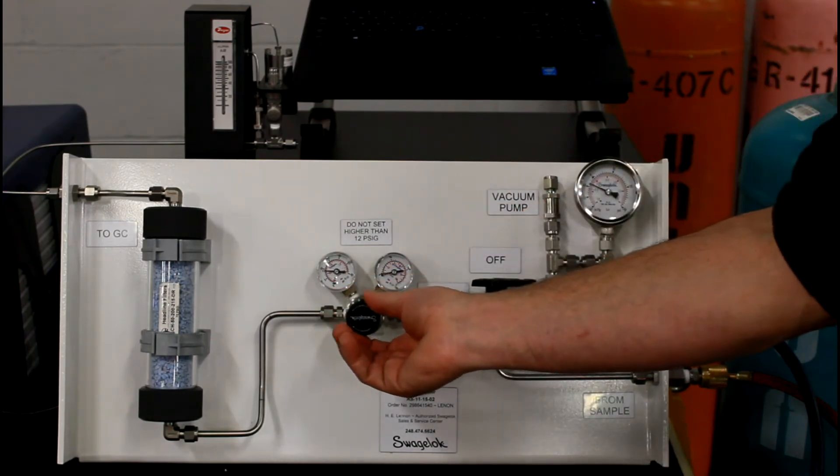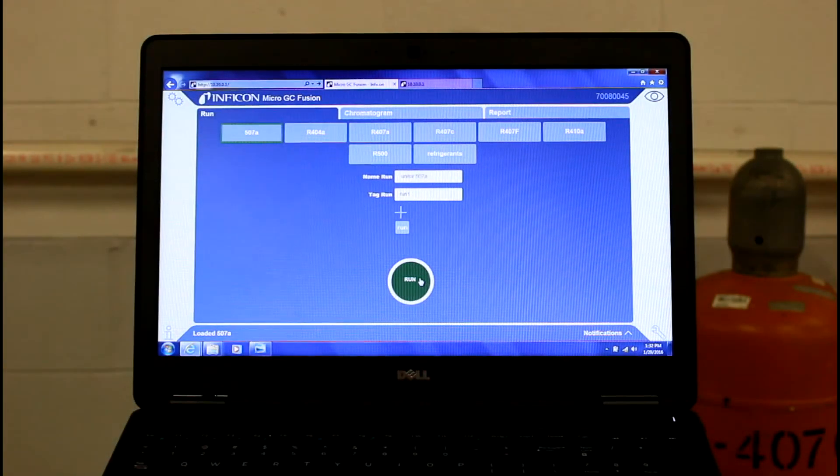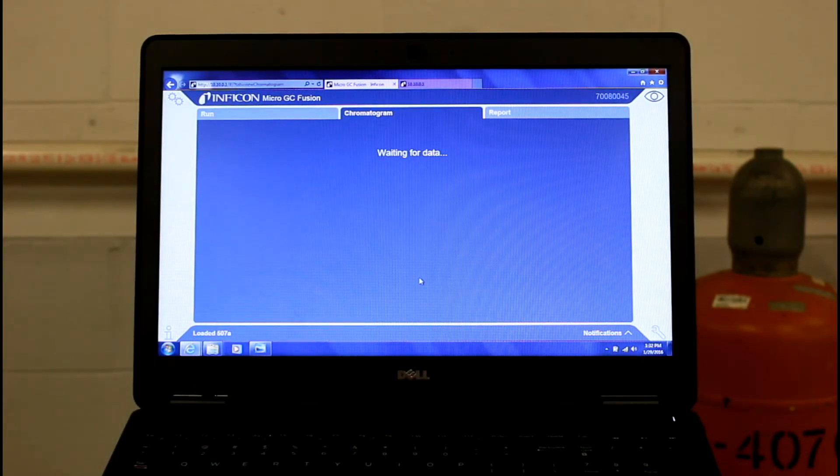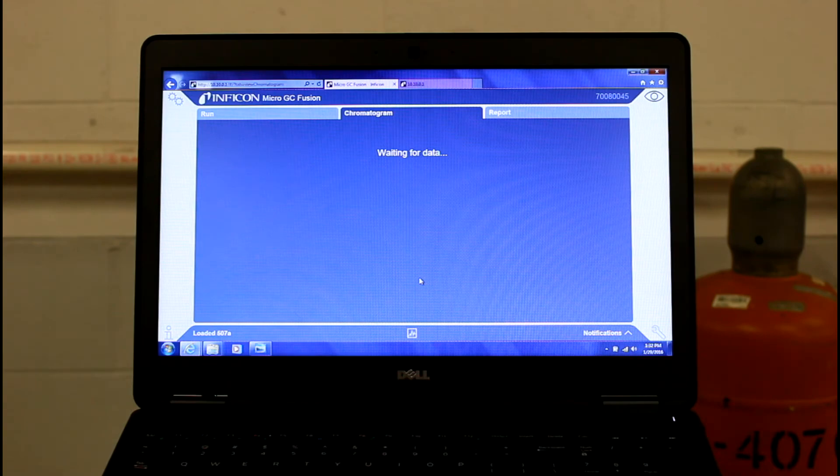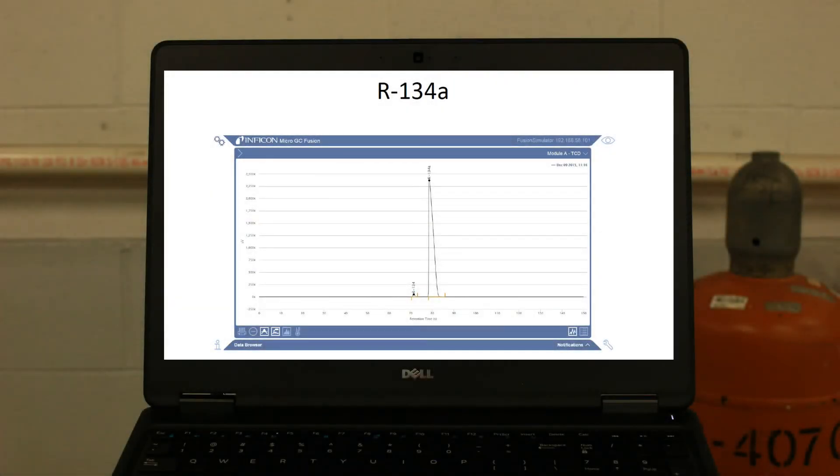Most methods currently in use are 90 seconds. That's it. Benefits of the mobile micro-GC system include quick and accurate identification of refrigerant products, the ability to bring the lab to the sample as opposed to bringing samples into a laboratory.